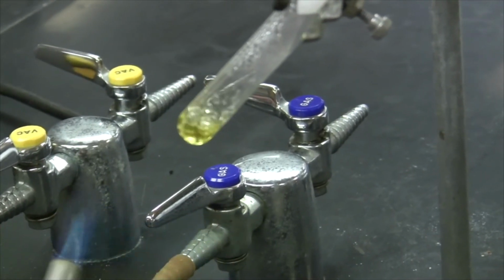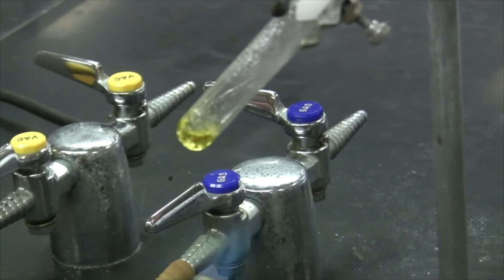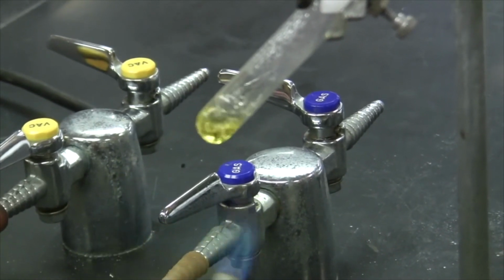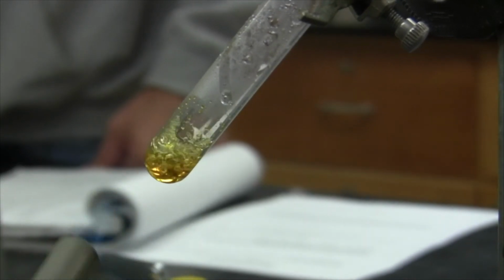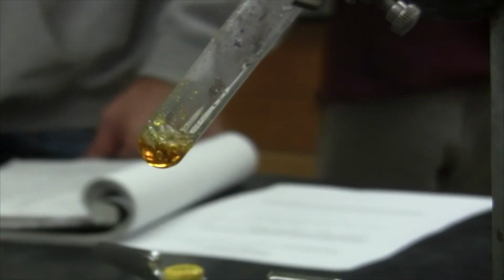After a few minutes of consistent boiling, our original pale yellow color will begin to turn a little bit darker yellow, a little bit brighter. As we hold a steady boil for a few minutes, the color will transition from pale yellow to a golden amber color, sometimes taking on a slightly orange or pink color.